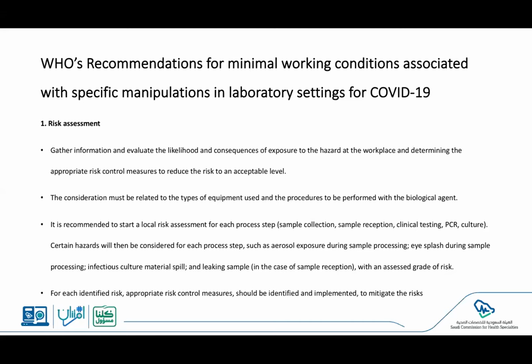So it's very specific to this infectious agent as well as to the equipment and the procedures. And that's why one of the most important steps in the risk assessment is actually to conduct it based on the steps. So, for example, you need to consider writing a risk assessment for the sample collection part, and then the sample reception part, and then the clinical testing, PCR, culture, and so on. So, for each of those tests or steps, you need to consider writing your own risk assessment accordingly.